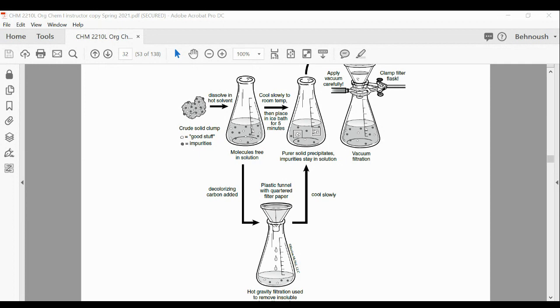That's for the design of the experiment. Today, we are not working on selecting the solvent. I only covered the theory, so you know how the solvent has been selected. That could be another experiment on its own. But when you select the solvent, it should be a solvent that either doesn't dissolve the impurities, or it dissolves them, but you don't recover them later.